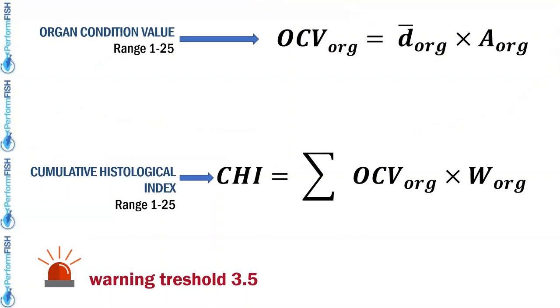However, later we discussed it with a colleague, and most of all a friend. He is an expert in systems theory and systems biology, who confirmed the correctness of our choice and helped us to finalize our formula. So we decided to summarize the large amount of data provided by the scoring system into a single value that would provide general information about the histological quality of the larval batch.